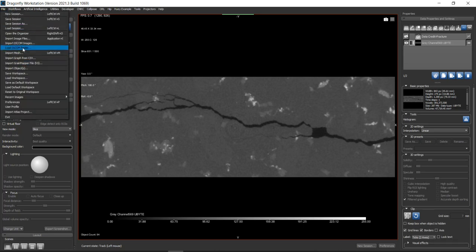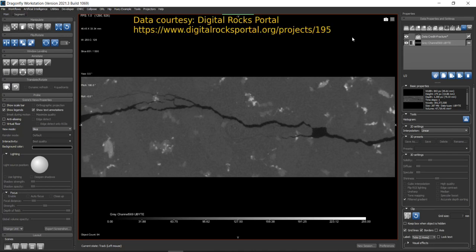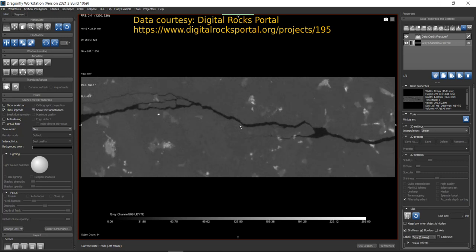In case you have image files of other file extensions, you can go to the File menu and use the corresponding imports to load your data set. The data used here for demonstration is a granite rock data set downloaded from the Digital Rocks Portal. You can also visit that website to find more information about the data set.